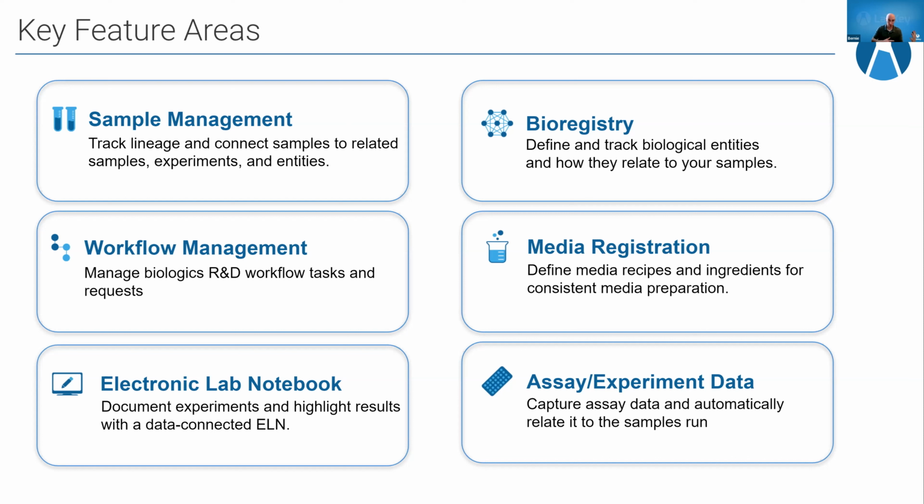But we allow you to capture both nucleotide and protein sequences in our bioregistry. Each of those, of course, are kept unique, and we allow you to annotate those with different sequence parts, which we maintain as those sequences are used to produce proteins of various types. We track their insertion into the constructs used. Those constructs are related to the cell lines that they're transfected into, and it's all well connected.